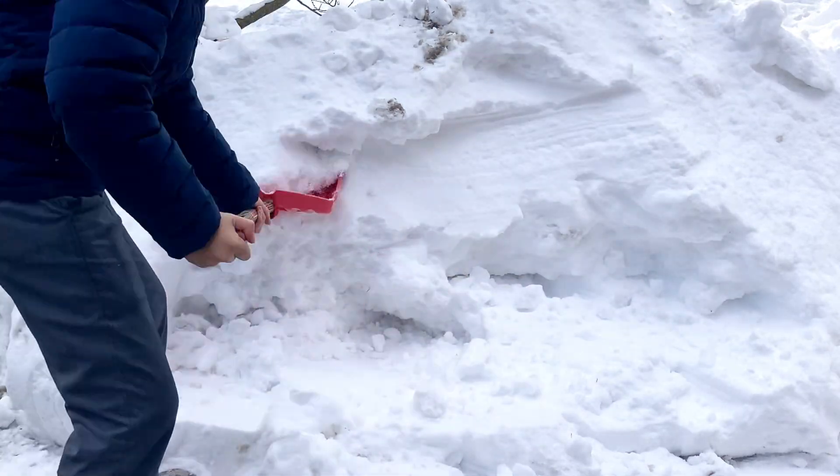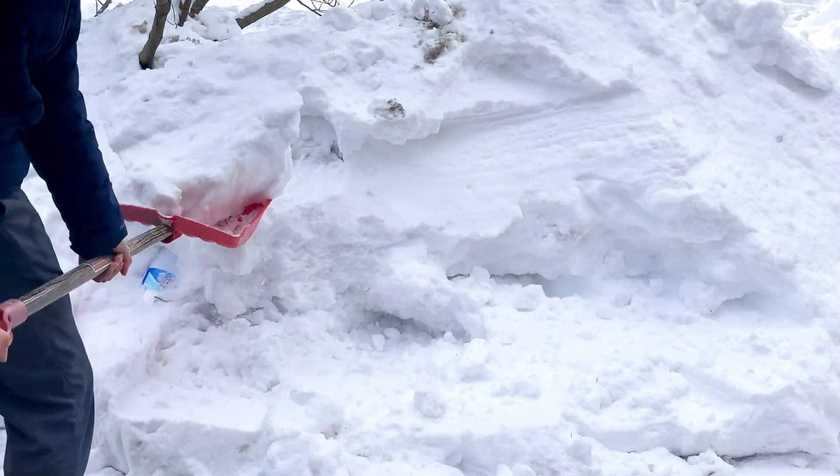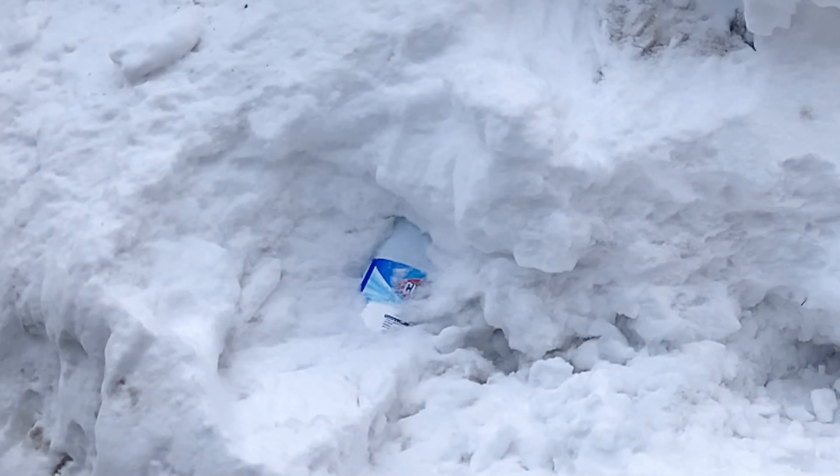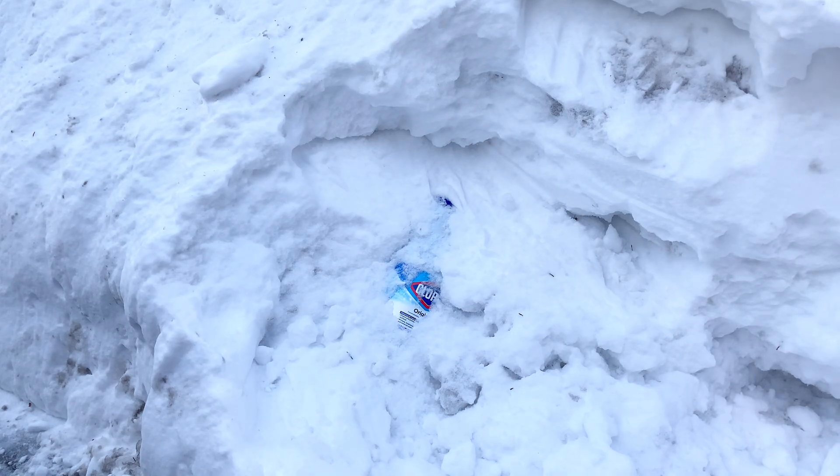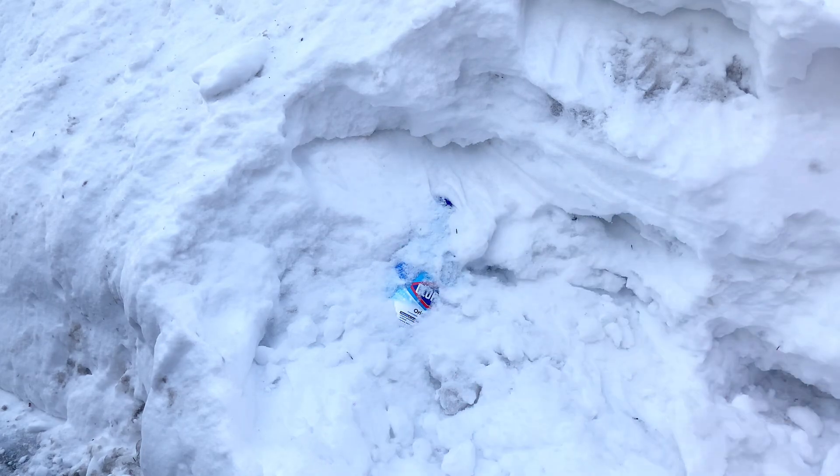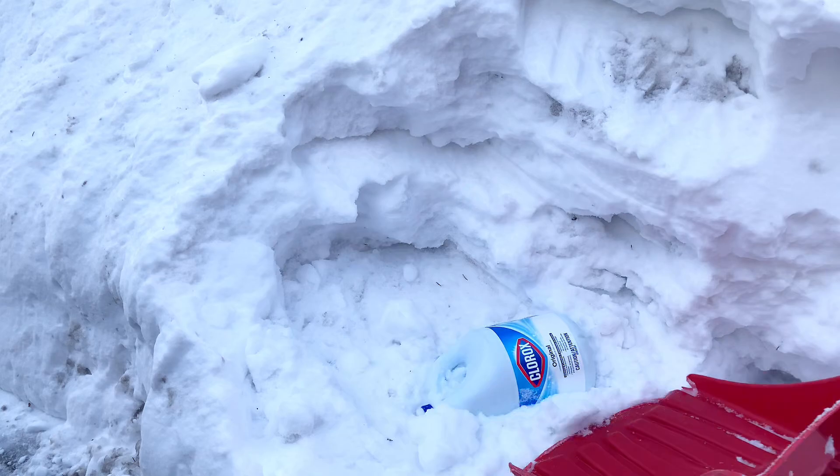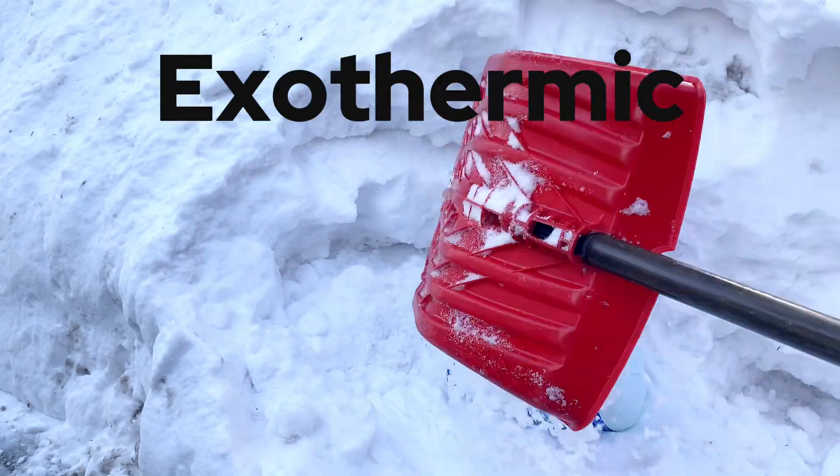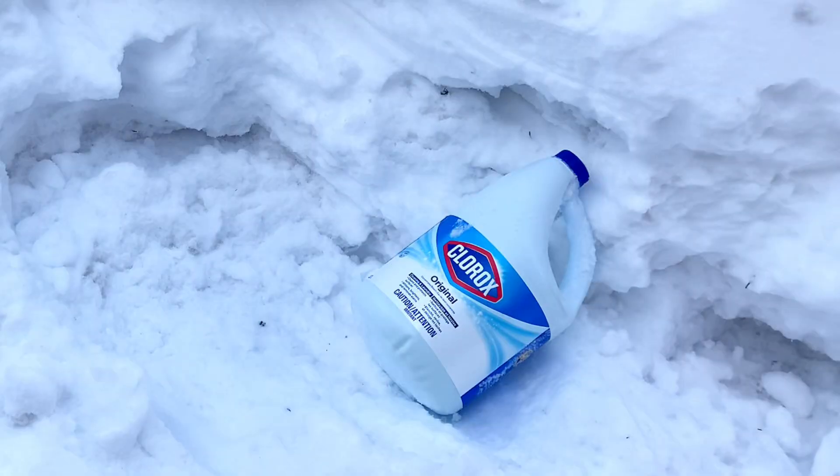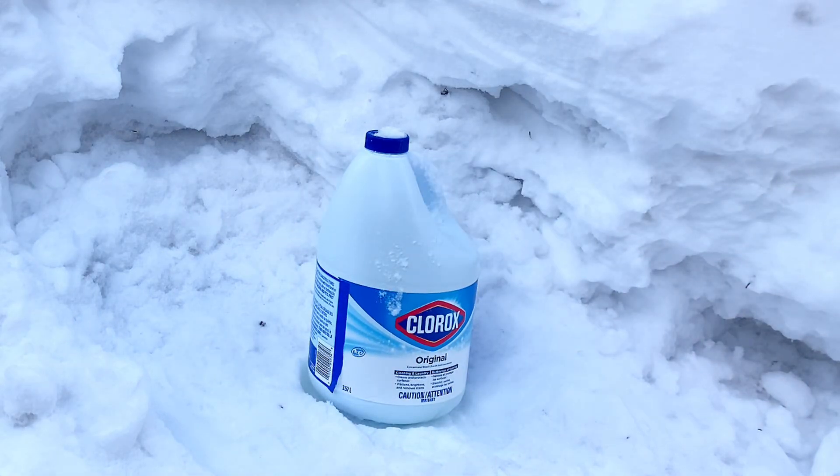Now you might be thinking, why in the world did he bury his bleach in the snow? Well, I didn't do that to make my life harder, but I actually left it outside the other night without realizing that it was going to snow this much in Canada. I wanted my bleach to feel the breeze of winter air because this reaction is exothermic, meaning it produces heat, and the bleach must be cooled to sub-zero temperatures to prevent this mixture from boiling.